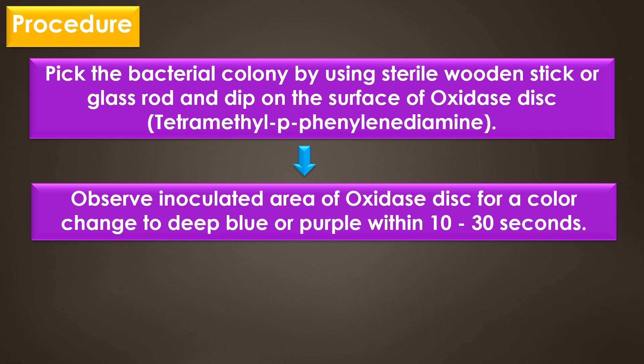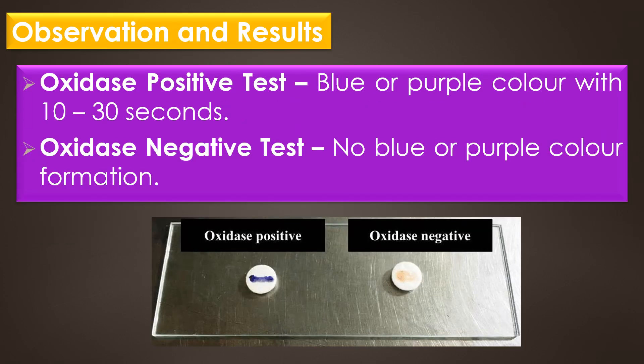Finally, observe the inoculated area of the oxidase disc for a color change to deep blue or purple within 10 to 30 seconds. An oxidase negative test shows no blue or purple color formation.